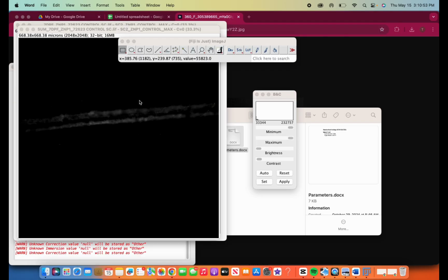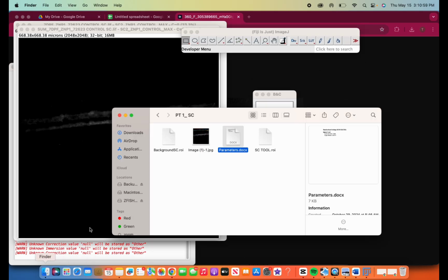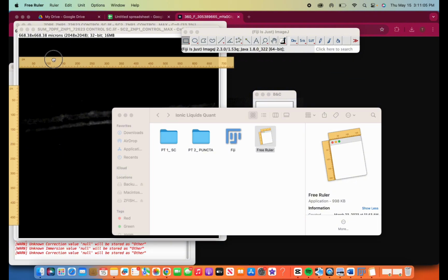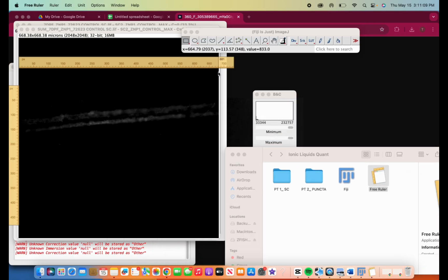So now that I've standardized it to be what it has to be, the next step is going to be taking our ruler. So now we can go back to this folder and open up our ruler tool. And we're going to divide this image into fifths. So you'll see that this ruler measures the screen up to about 681. We could say about 680 to be round.